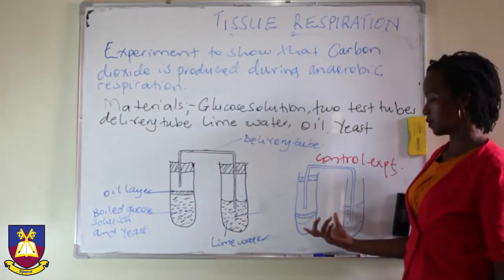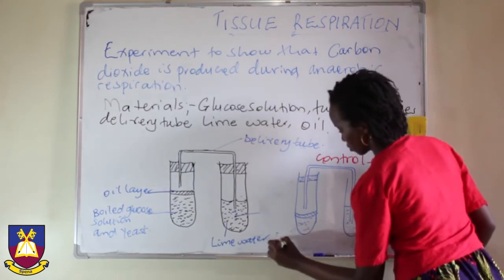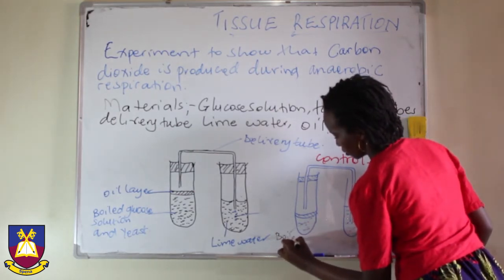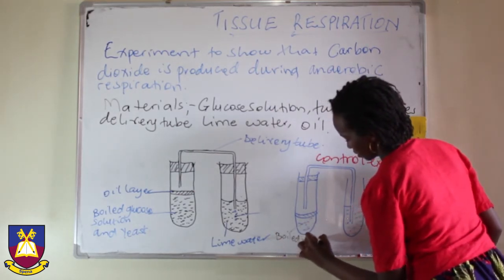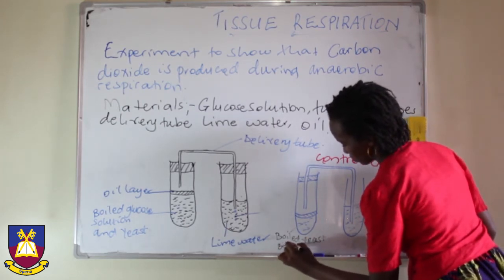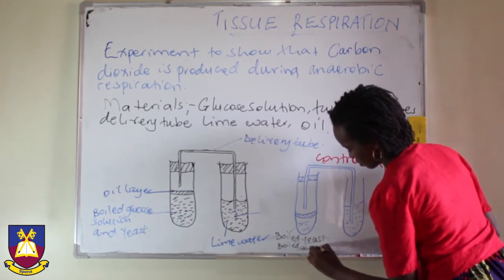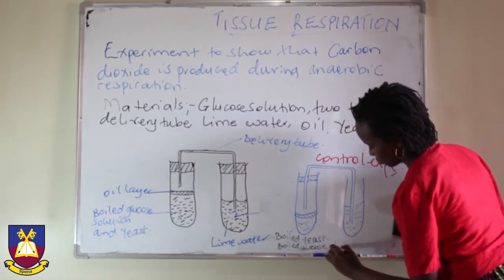Our experiment will still remain the same arrangement, same procedure. The only difference here is we shall have boiled yeast and boiled glucose solution.